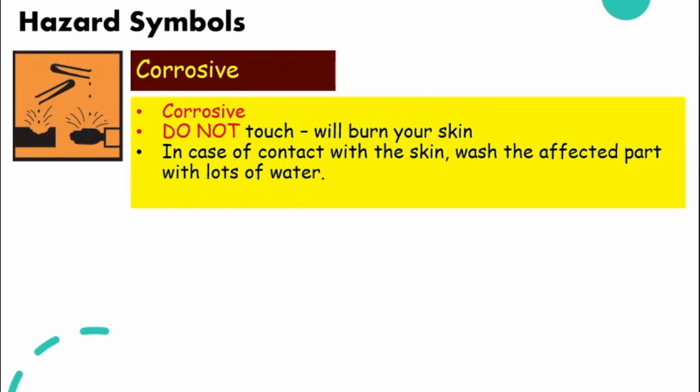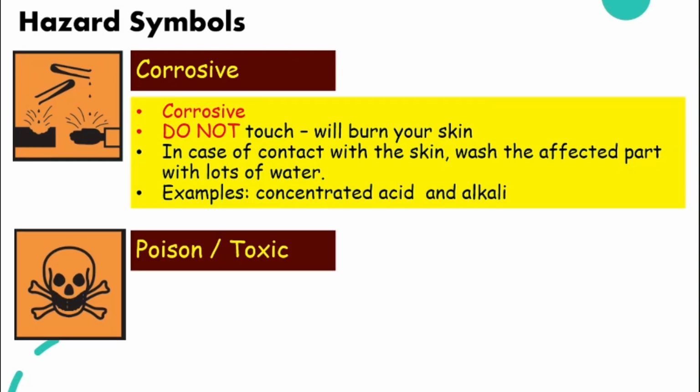In case of contact with the skin, you need to wash the affected part. Say you have it on your palm. Okay, you need to wash your palm with a lot of water. And some of the examples will be concentrated acid and alkali.